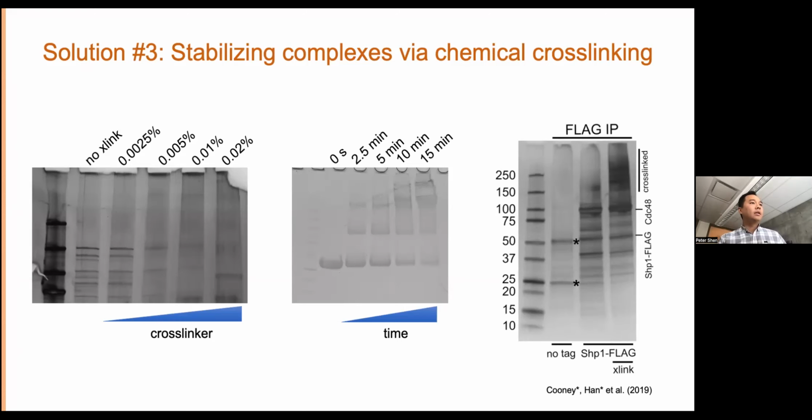And let's see, Carl, follow-up. Do I need to do dialysis after treating to remove excess glutaraldehyde? No, we don't remove the excess glutaraldehyde because we quench with excess Tris. I think the concentrations come out to be about 1 millimolar final concentration of glutaraldehyde and between 5 to 10 millimolar of Tris. So we add excess Tris, but 5 to 10 millimolar we feel is tolerable.